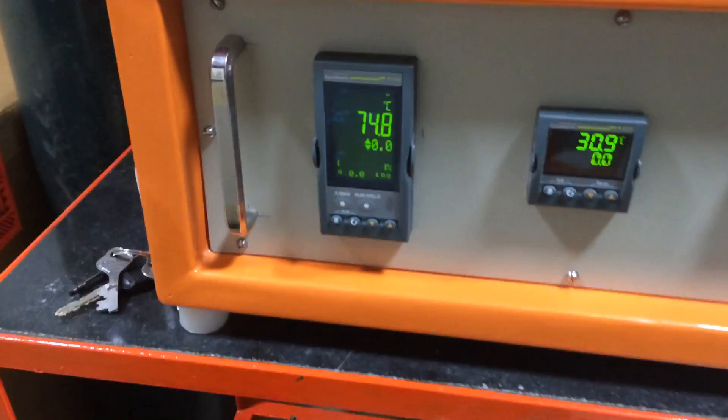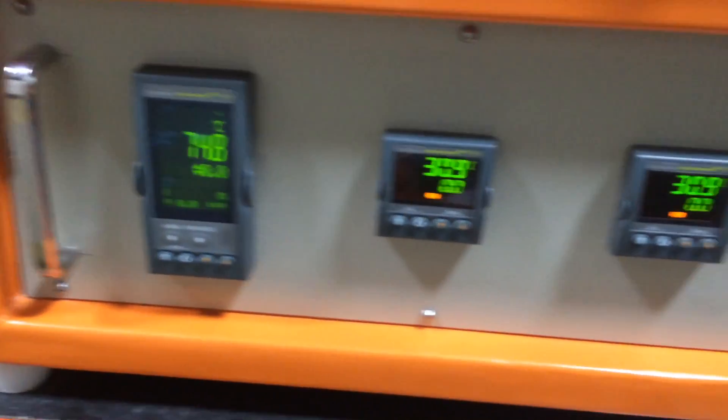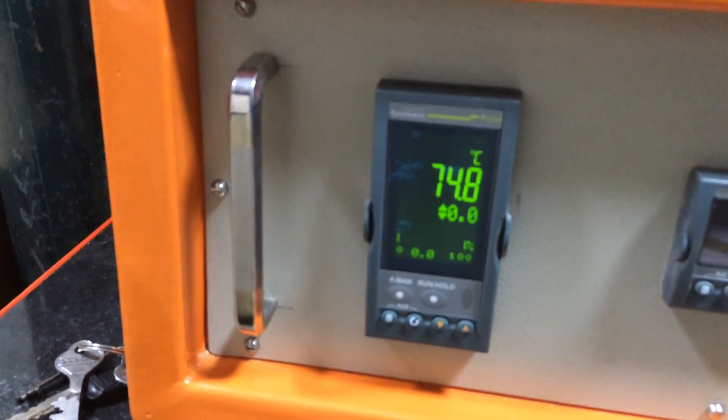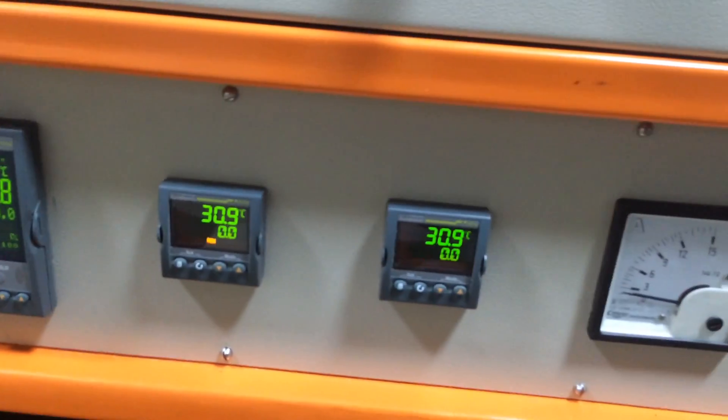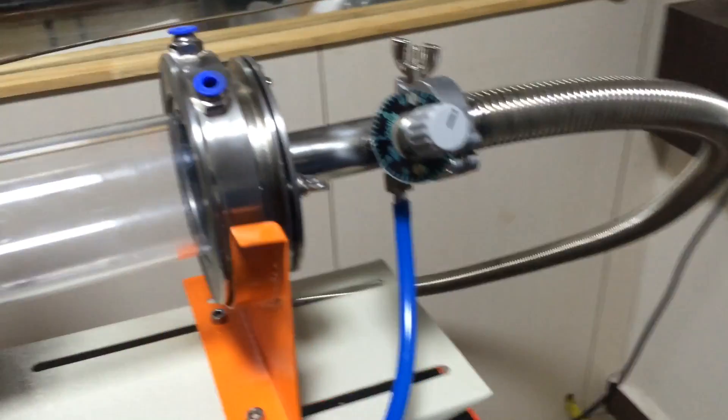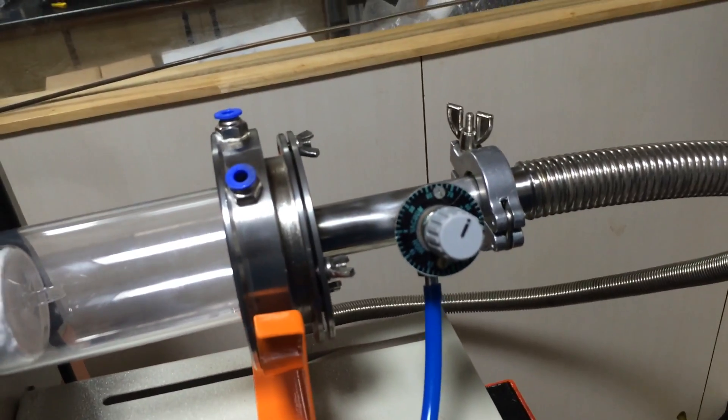You can see there is a master controller and two slave controllers. The master controller is where we fill the program, and it gives orders to the next one. Here is the Pirani gauge, which shows the vacuum level, and this is the vacuum pump. This is the outlet made of stainless steel.